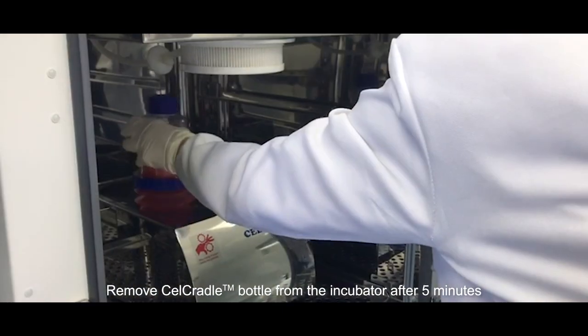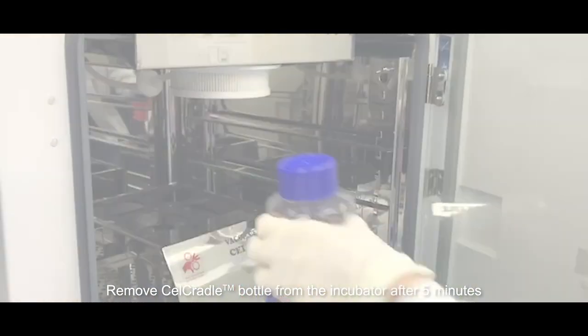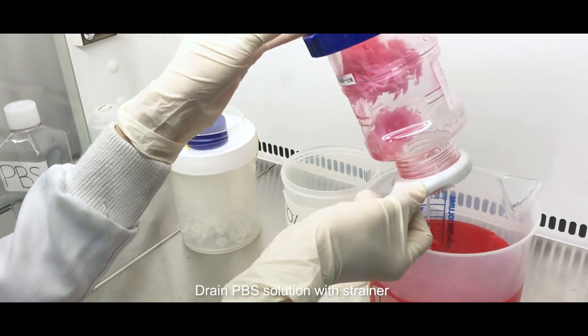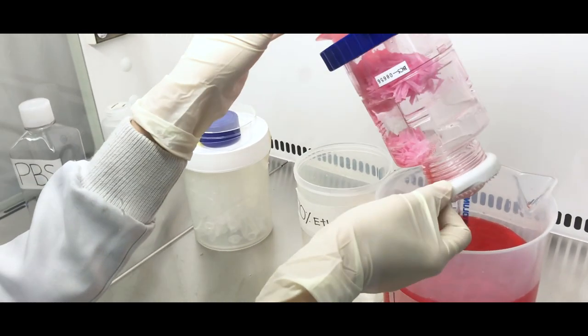After five minutes of incubation, remove the bottle from the cell cradle stage. Drain the PBS solution using a strainer. Subsequently, repeat the rinsing steps again.